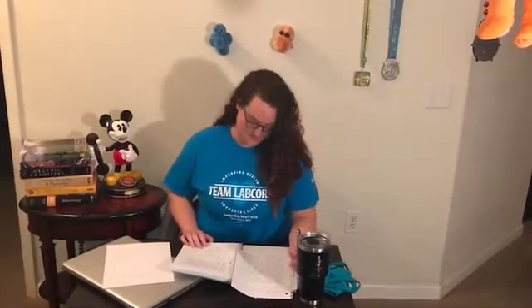Thank you for tuning into Lab U from Pipette, New Mushroomton. I am Professor Terbium, and today we will be discussing the Bradford Assay. The Bradford Assay is a quantitative measurement that measures the concentration of the protein within your solution. Once you have isolated your protein of interest in this solution, we will add the Bradford reagent.